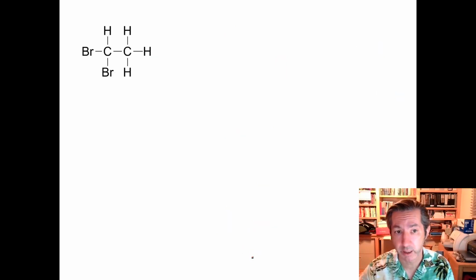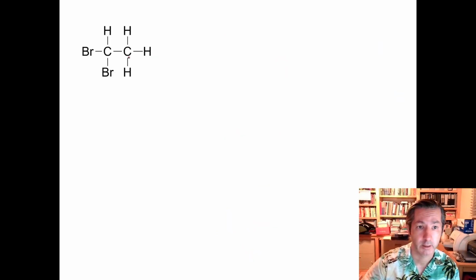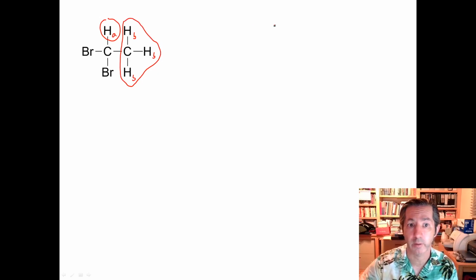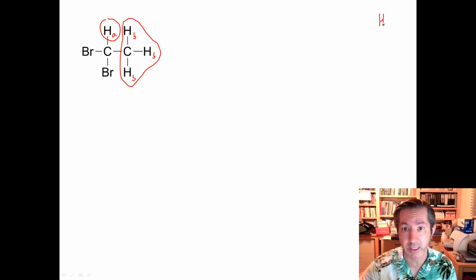But let's say here's HB. Let's see, they have a kid. Now we have three neighbors next door to HA. So we have a family of three HBs. So these guys are all in the same environment, and this guy's in another environment here. So we have three neighbors next to one neighbor. Now, here's what happens. You've got all those HBs there.